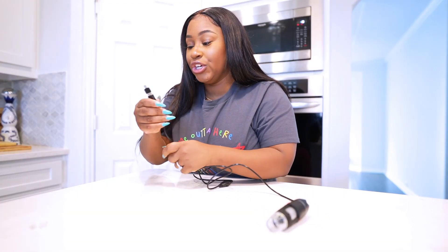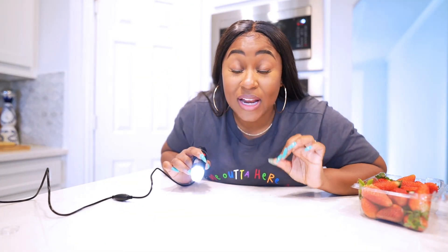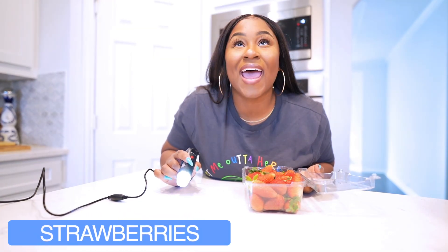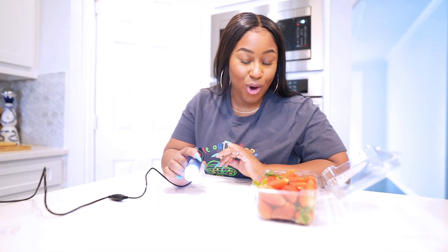Let's go ahead and hook this up and plug it into the computer. There's a little black light. The first thing we're going to be looking closer at is strawberries. I had to do strawberries because lately strawberries have been very suspicious — they look like they just got something going on with them.